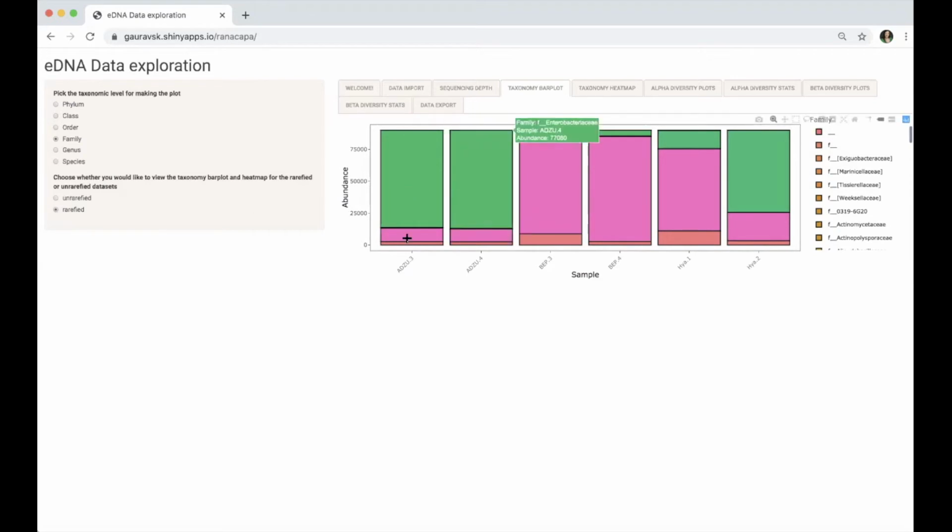And so again, here we see a similar thing where we see the same kind of amounts between our Adzuki beans of the three different types. And we see a slight change, which is expected for rarefaction, with our black-eyed peas, but in general the trend is similar. They're still both dominated by Staphylococcus.